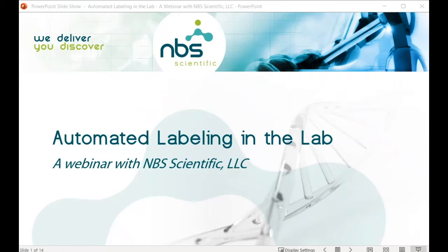And today we are here to present to you a webinar on automated labeling in the lab, which will ultimately culminate in a live demonstration of the Sci-Print VX2 fully automated tube labeler from Scinomix.